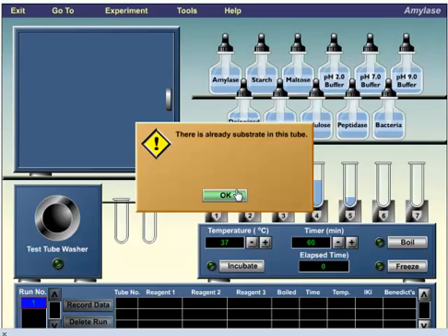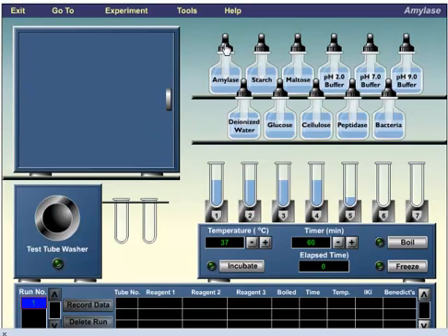In tube number five, let's add cellulose, starch, water, and let's assume this one is going to be pH seven.